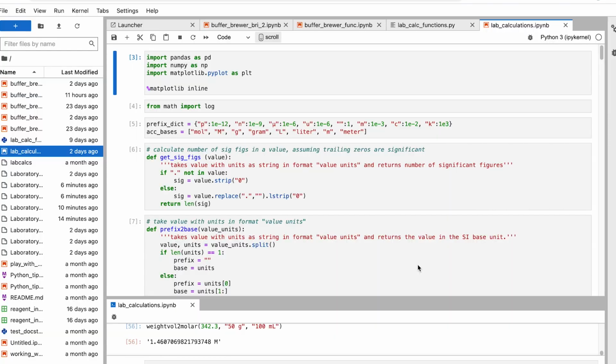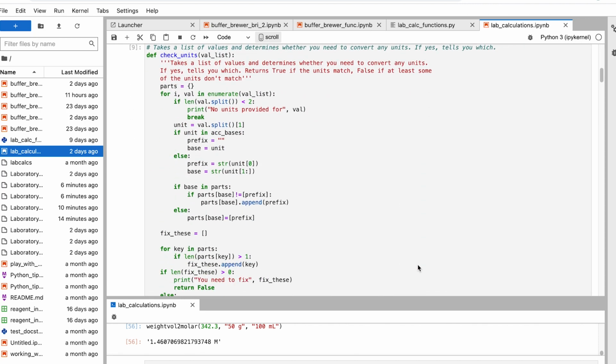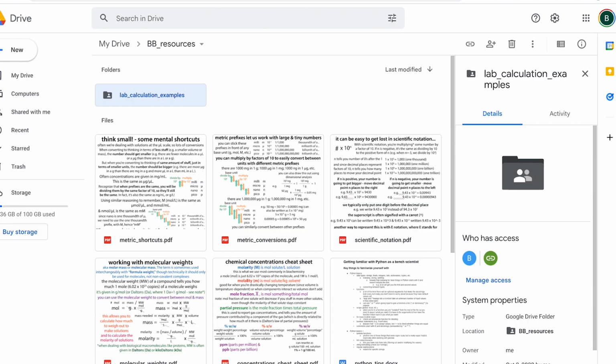And yes, there are calculators that can do this stuff for you, and it can be really helpful, and it can actually be a good way to learn Python, to write functions that do this for you and then check your work. But it's really important that you know how to do them yourself, especially because a lot of times in the lab you're having to do these kinds of calculations on the fly, on paper towels, on gloves, but then make sure you transfer them to your notebook.